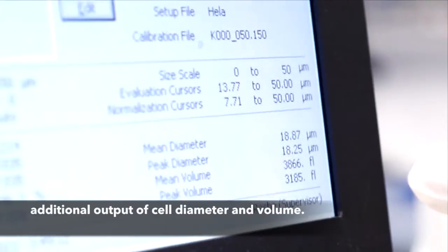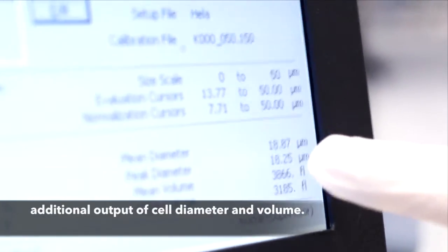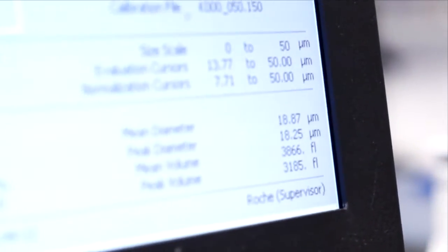In addition, we also obtain the diameter and volume results for the cells. Here, the typical mean diameter for the HeLa cell is 18.87 microns.